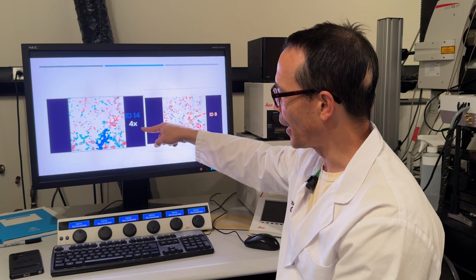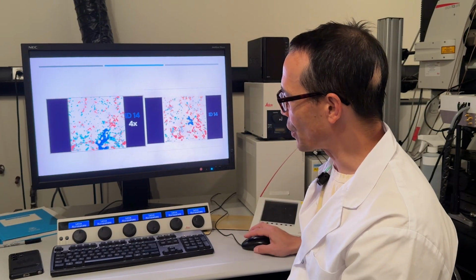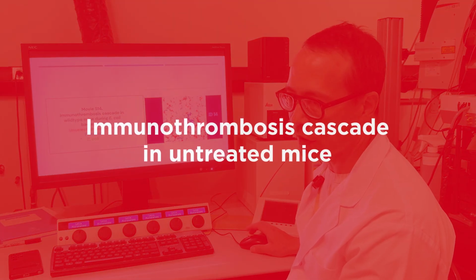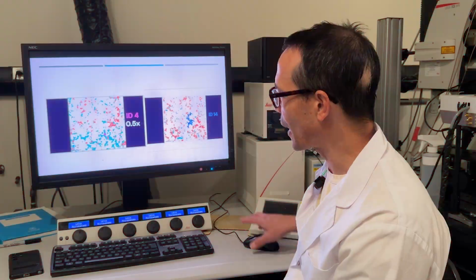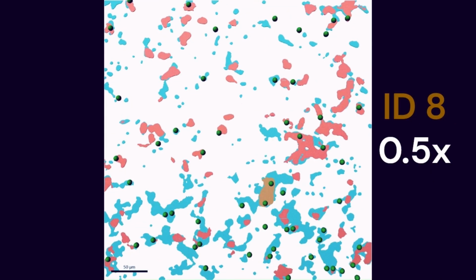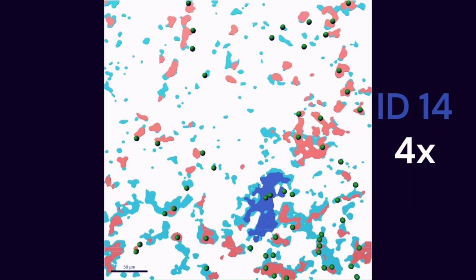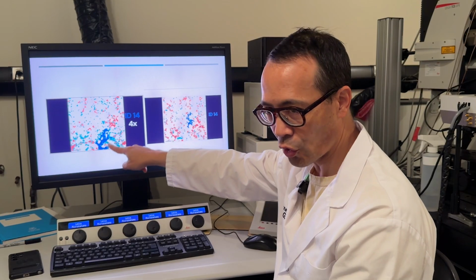This is how we differentiated how they begin, by watching what stages they start at, and so we designated those as different numbers, and in this case different colors. So it went from 4 to 8, 8 to 14, and then once it gets to 14, it doesn't stop. It just makes this huge cluster.